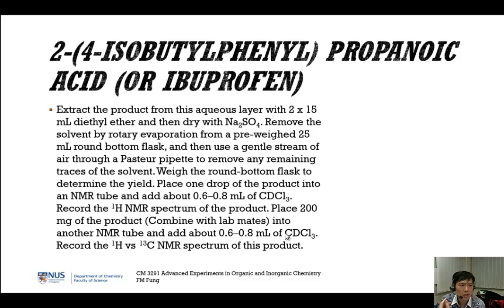Okay, and your lab officers record a 2-dimension NMR proton against carbon, so you can see the cross coupling between the carbon atoms and the hydrogen atoms. It's really interesting.